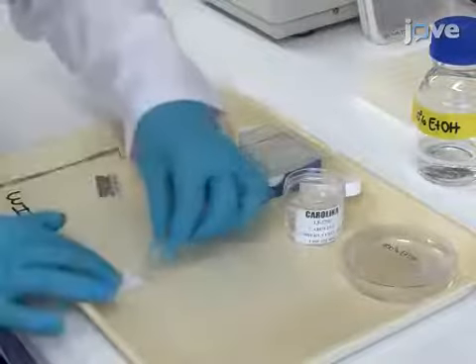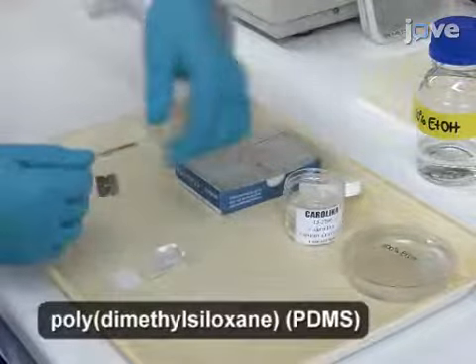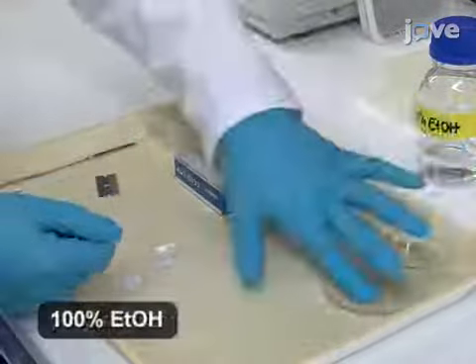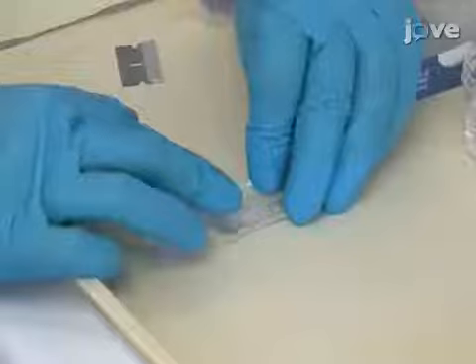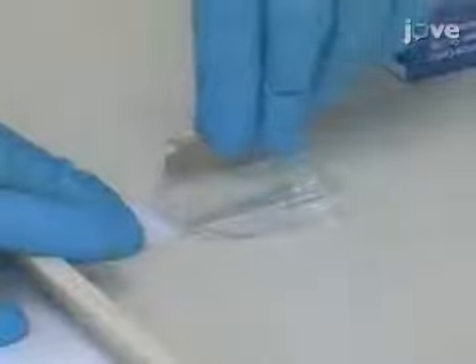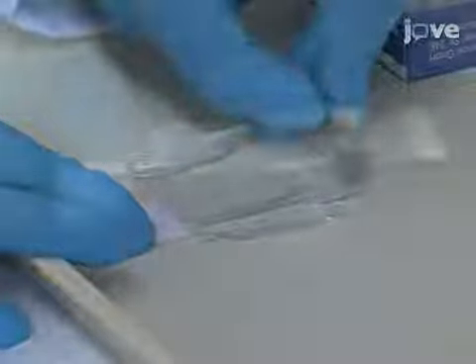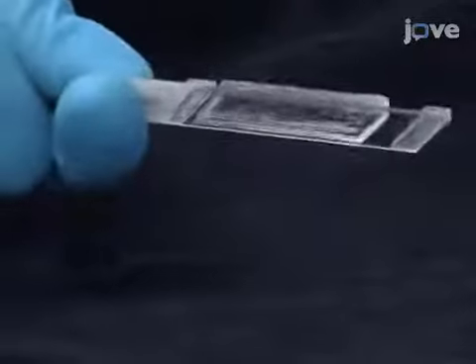Now, make a gasket of the same height from gas-permeable PDMS gum. Wet a second slide with a little absolute ethanol and flatten the PDMS onto the slide to the height of the glass strips. Next, wet a blade with absolute ethanol and trim off any excess PDMS. This is critical as tools wet with ethanol will not stick to the PDMS.